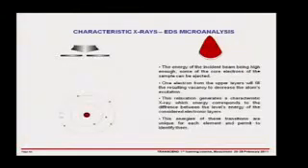The idea of this is that you have an electron coming in, which knocks out an inner shell electron, and then you have another electron which falls into that inner shell. And because of the quantization of energy of electrons, the X-ray which is emitted, as the difference in these energy levels, is characteristic of the element that's present.